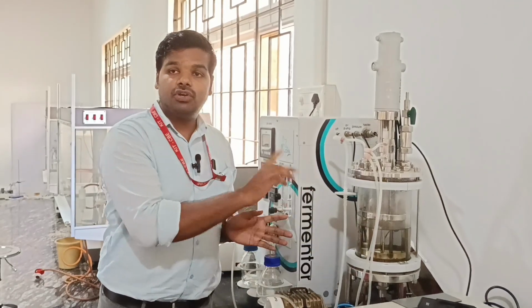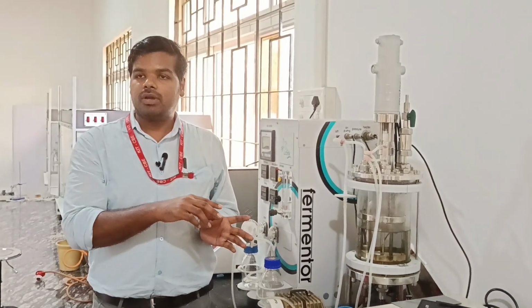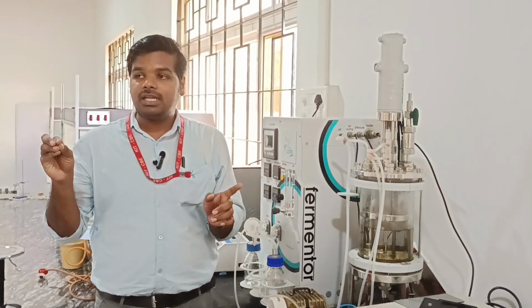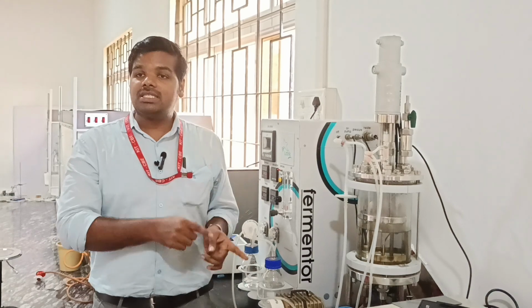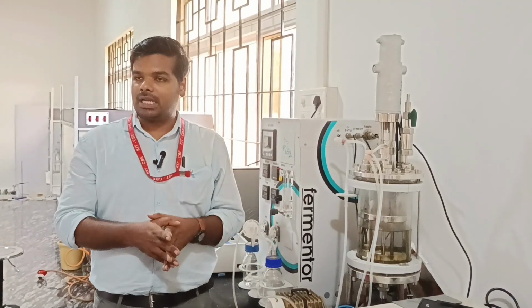We are just switching on the fermenter. The temperature will be noted down at different time intervals. For our microorganism, if you know the temperature, I can calculate k, because we determined the activation energy and Arrhenius constant for that particular microorganism.